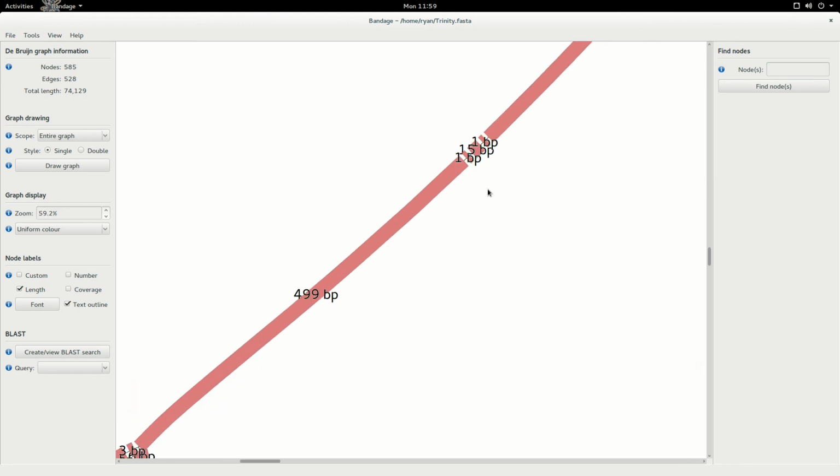That's all for this video. I hope it's given you a better idea of how to use Bandage's settings to control the shape of your graph.